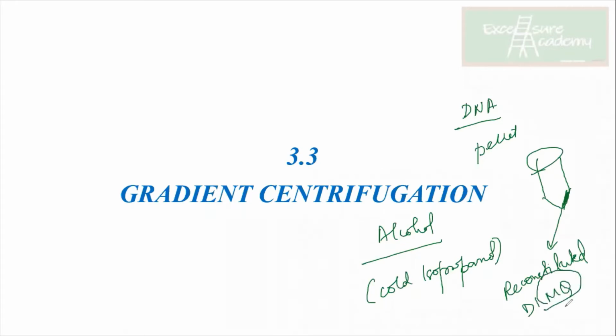Why do we say Milli-Q? Because it's the name of the company which gives you the deionized water. Okay, so what is the short form? We don't say, do you have double deionized water, that becomes a bit long. So the lab slang becomes, do you have Milli-Q or not. Okay, it is a company, a machine, which gives you the double deionized water. Okay, so either in the Milli-Q or in the TE buffer.